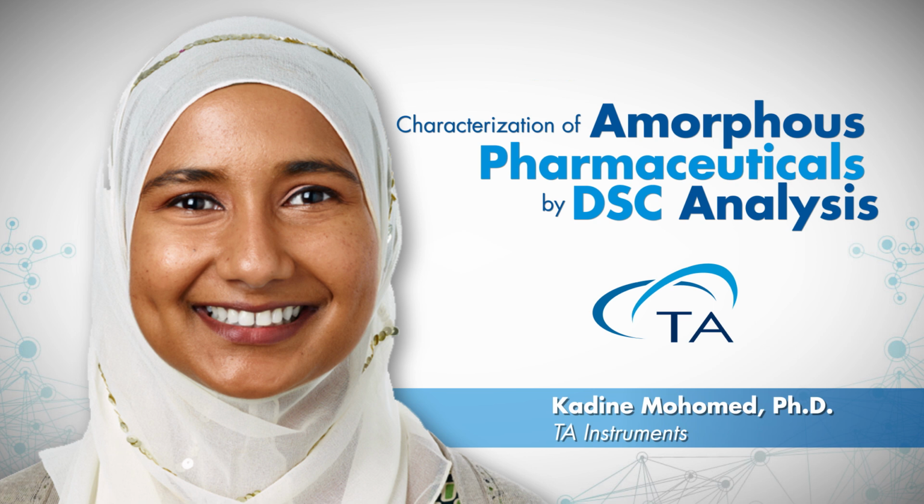So what would be conditions that will make it a little bit more difficult for the sample to follow that modulation? Using a slightly larger sample mass, a faster heating rate, or a shorter period. Those are three of the conditions that you can use. But really, I would start off with some of the general guidelines that are listed on the template when you launch the software for heat-iso modulated conditions, and then go from there.